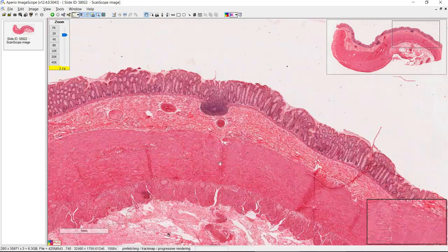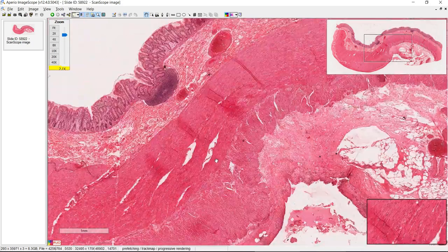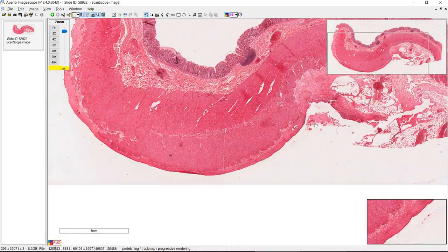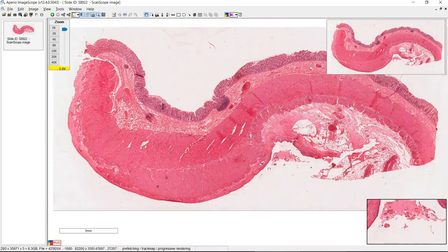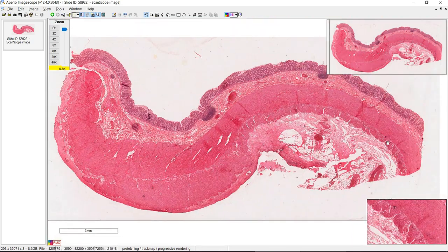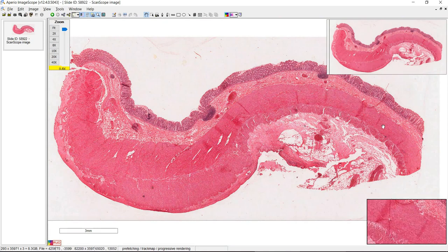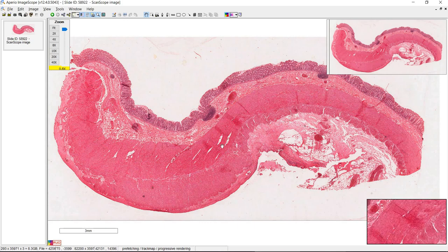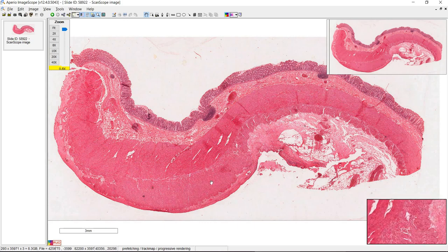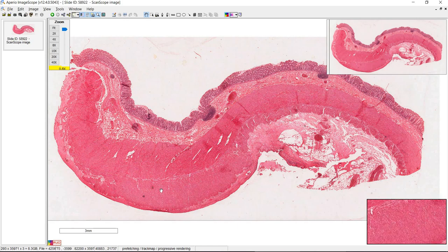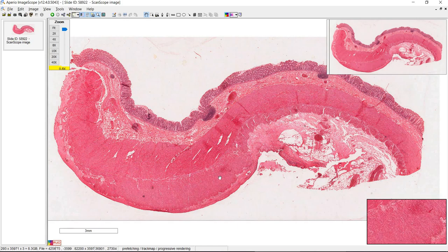One unique feature that the colon does have is the teniae coli. If we zoom out to low power, you can see this is the outer longitudinal layer — it's relatively thin. Here's your inner circular layer. But when you get to here, you can see that it thickens very considerably. And there are three bands of longitudinal muscle called teniae coli.